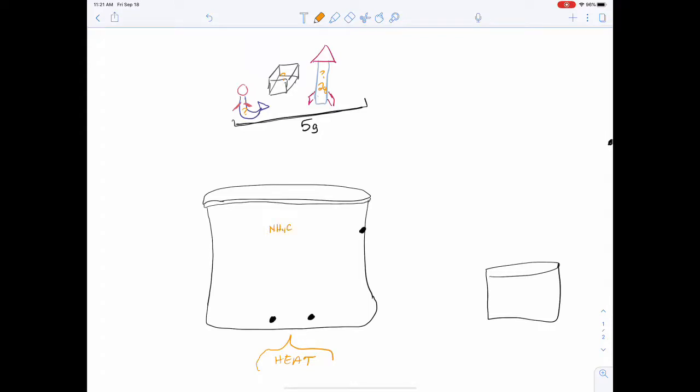What's really happening is that this compound is changing into 2 things that are gases. When this happens, you make NH3 as a gas and HCl as a gas. That's when you heat up this compound. So those 2 gases will leave, and you're effectively removing that whole NH4Cl compound. But it's reversible, so if it gets to a point where it starts to cool down and 2 molecules run into each other, they'll reform NH4Cl. That's what ends up stuck in the upper section of the beaker.